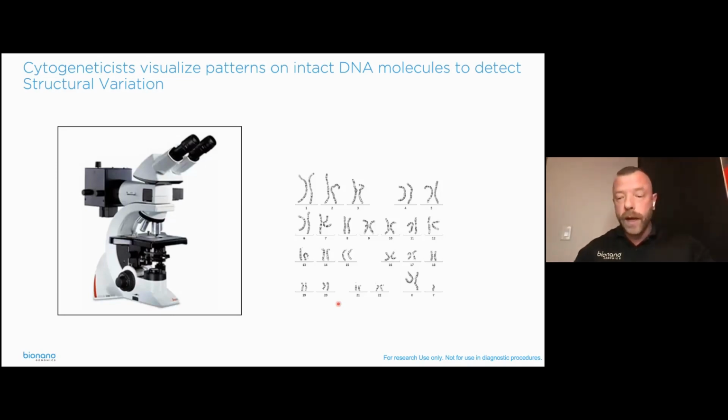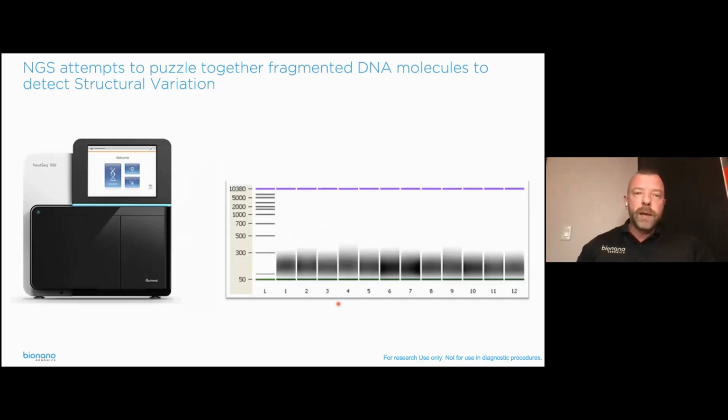Now, why is that? Why hasn't sequencing replaced all of that? Well, this is one of the reasons why. If you run an NGS experiment, if you're using short-read sequencing to look at the genome, the first step is fragmenting the DNA. Here's a graphic from a company that produces these tools that fragment the DNA, that proudly shows that nothing is left over 300 base pairs.